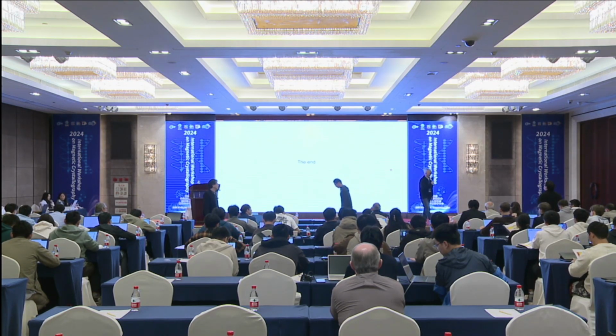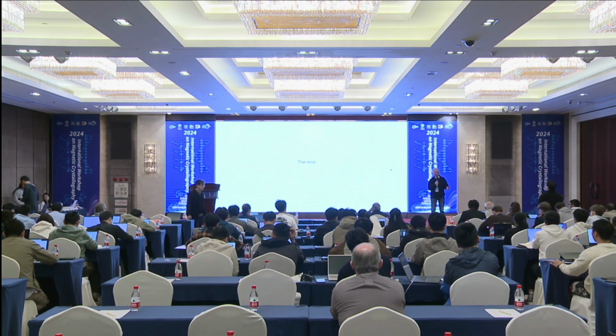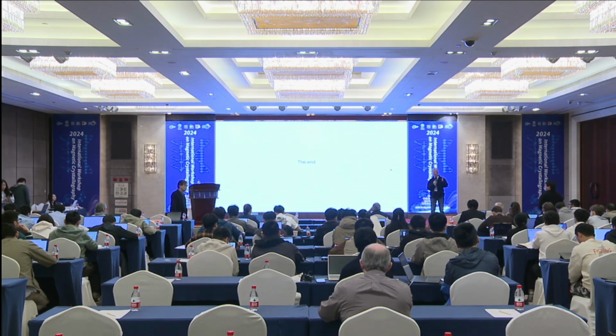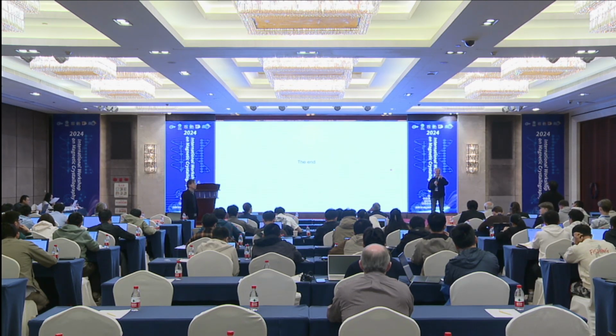It's the same as the nuclear, okay? So, for example, the first capital letter in the space group means the lattice. Then the second, third, and fourth positions are for the directions. For example, in the trigonal space group, you have only one letter after the lattice.